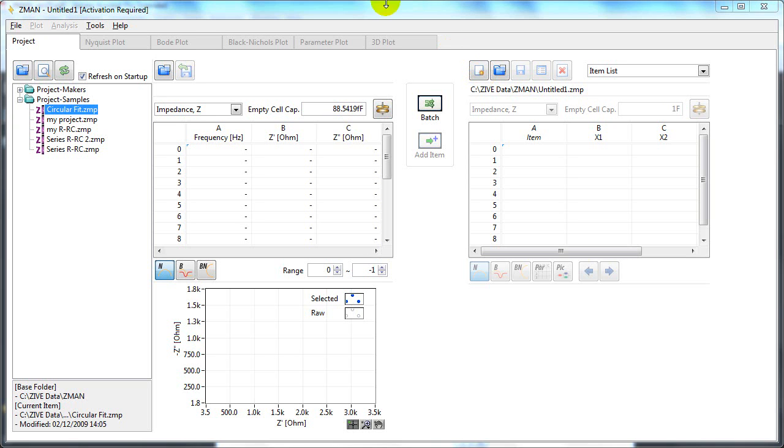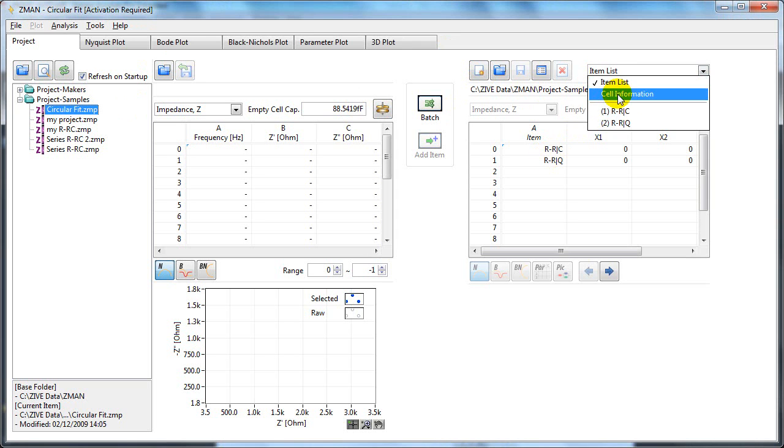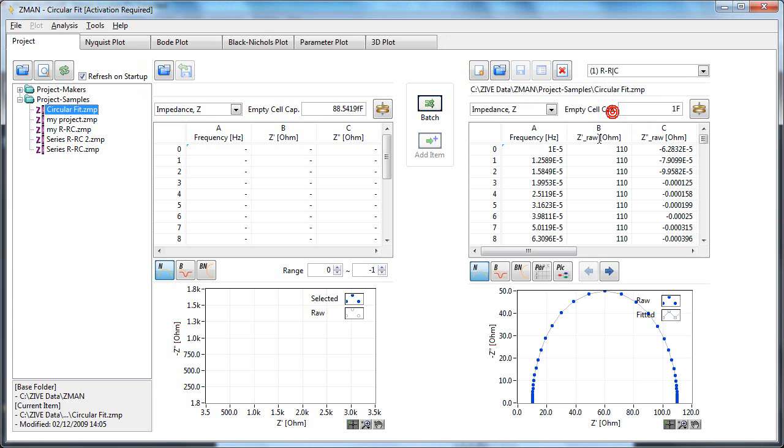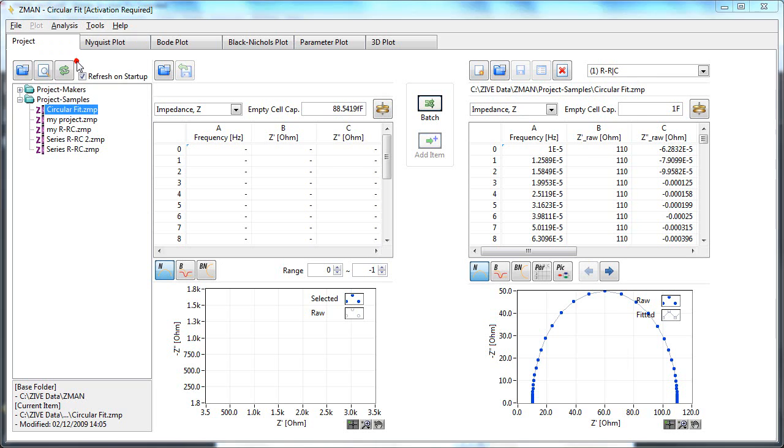For example, if you open the circular fit project by double clicking and select one of the items, you'll see this has a semicircle. You can access this from the analysis menu, click circular fit.